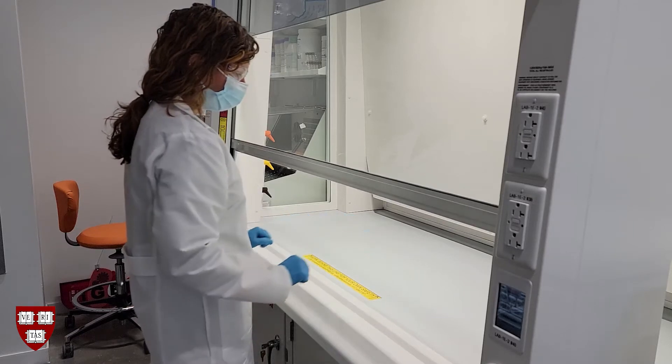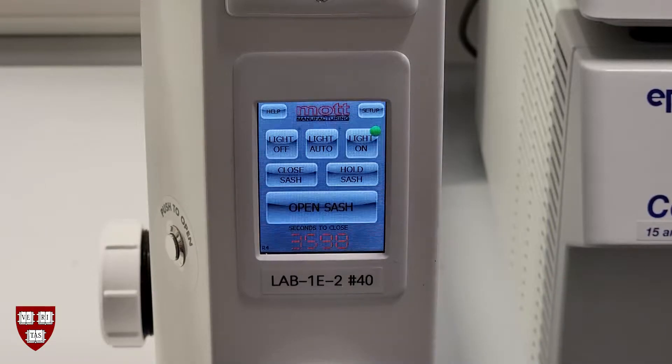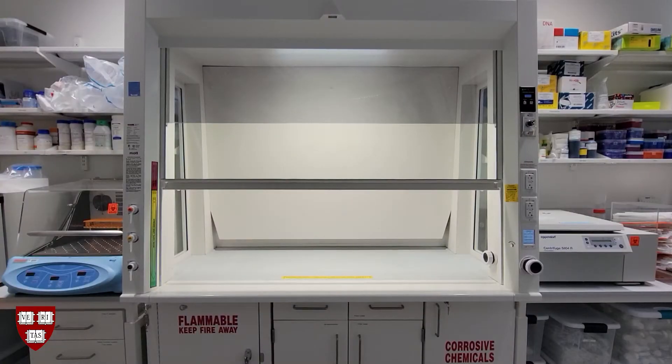To hold the sash in a particular position, press the hold sash button on the digital control panel. You will see a timer appear that indicates how long the sash will remain open in that position. To cancel the sash hold, press the hold sash button on the digital control panel again.